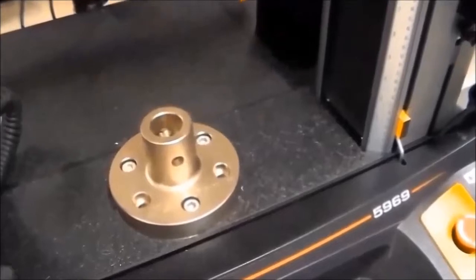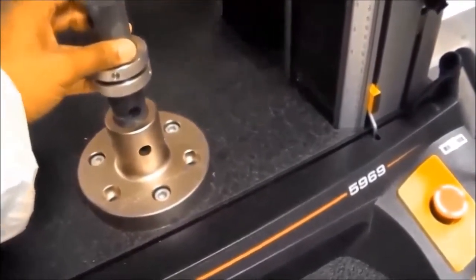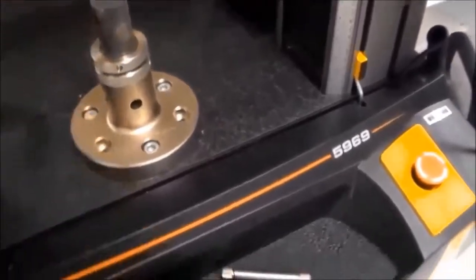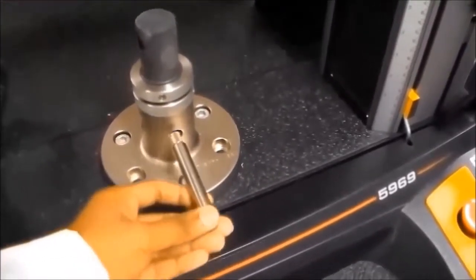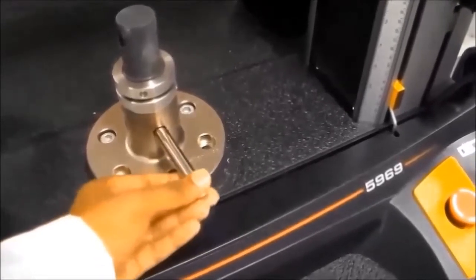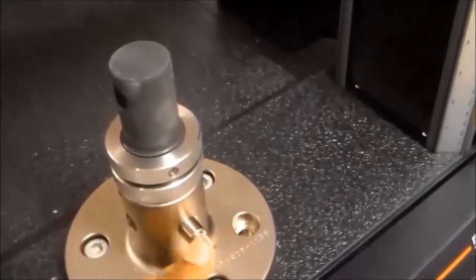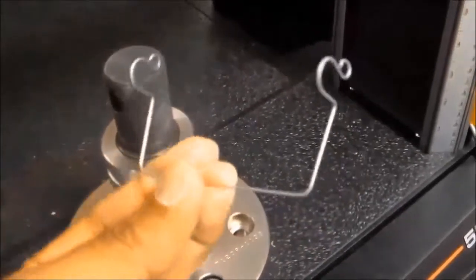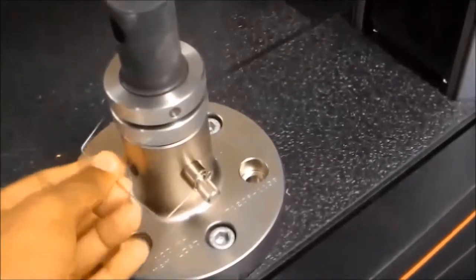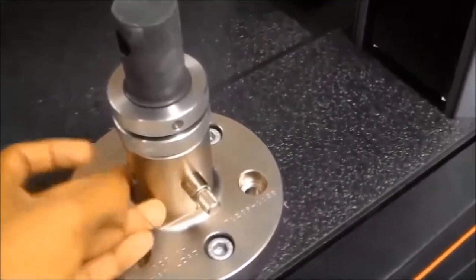First, we have to connect the system with the base adapter. Place it here and then lock it by inserting the pin in this hole. Once the pin is placed to lock the system, use a lock wire to secure the pin so that it does not move around.